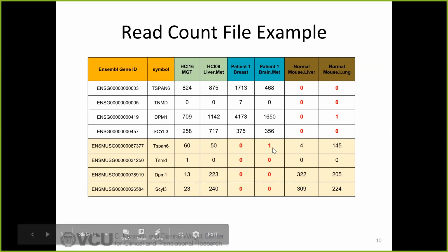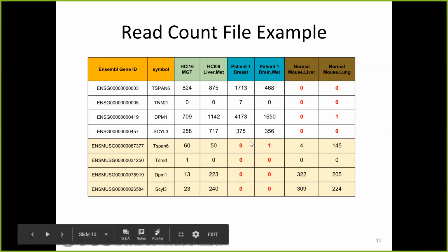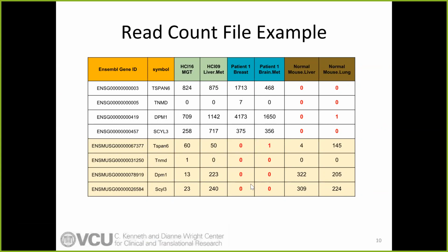Like I said, there is noise. So we did find a tiny bit of patient expression that got mapped to mouse, but it was really so small, it's what we expected to happen. However, if we would have gotten a lot of patient data mapping to mouse, we would have said, hold on, there's something wrong with our pipeline here.